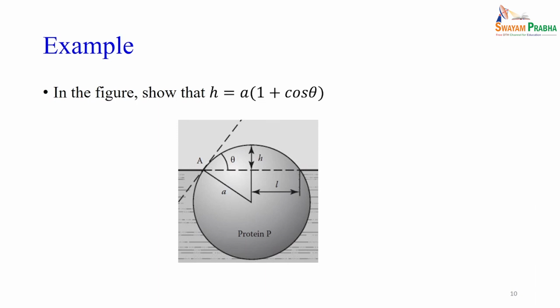So, here I have listed one more example. As I was telling, if you can fit the imaginary circle like this, experimentally by analyzing the image, you know this is the height h, this length is L, and A is the radius. So, this will be A minus h. Now, the angle of the tangent should be equal to the interior opposite angle. So, this angle is theta.